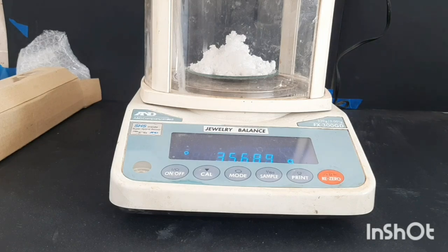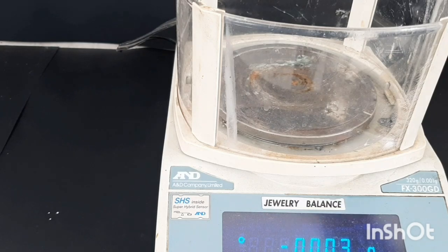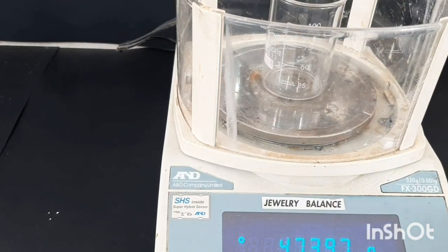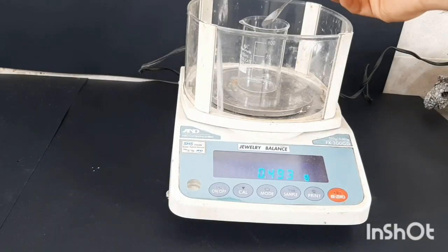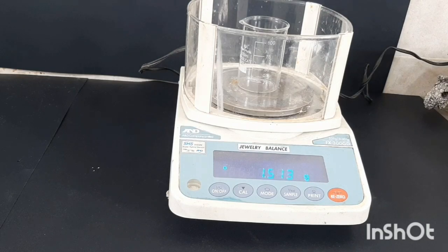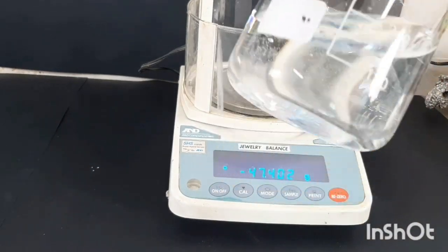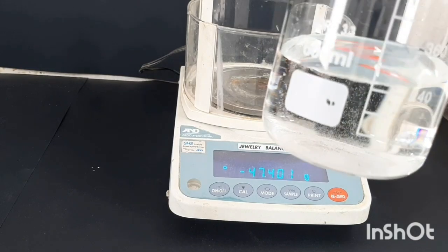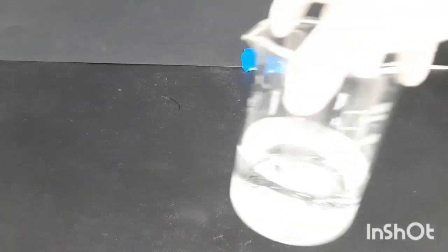So let's begin. I started by taring a small beaker so that I can add 1.5 grams of tungsten metal powder. I bought tungsten powder for another reaction and I was lucky that I had some left. I also measured around 270 grams of hydrogen peroxide. The hydrogen peroxide that I used was sold as 30% industrial grade hydrogen peroxide, which has been tested by an analytical lab to be 29.8% hydrogen peroxide.